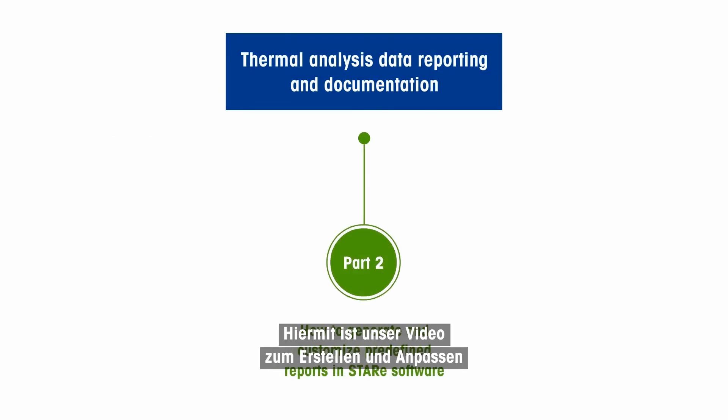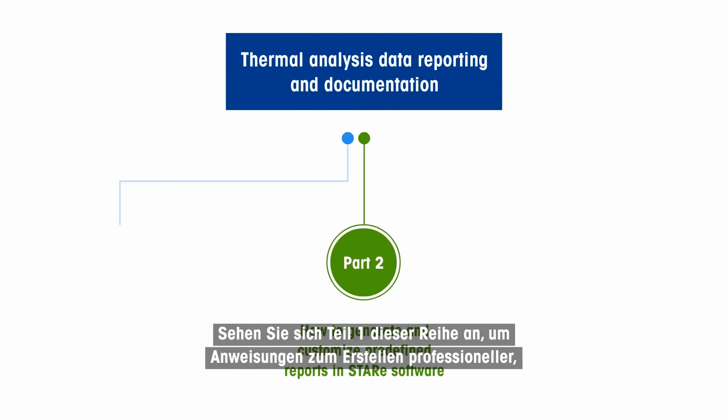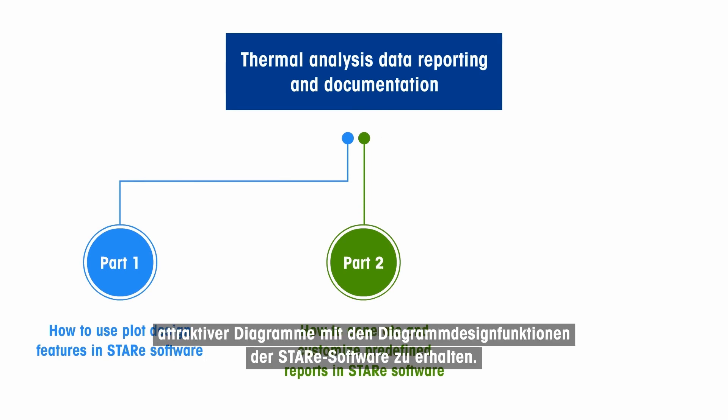This concludes our video on how to generate and customize predefined reports in StarE Software. View Part 1 of this series for instructions on how to create professional, attractive plots using StarE Software's plot design features.